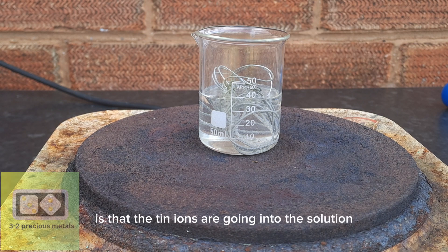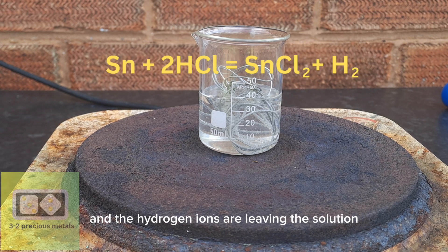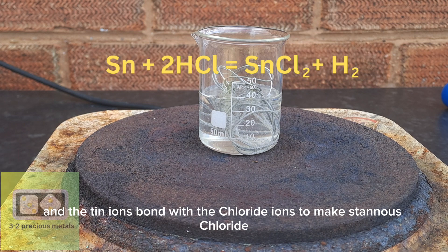What is happening here is that the tin ions are going into the solution, and the hydrogen ions are leaving the solution. The hydrogen leaves as a gas, and the tin ions bond with the chloride ions to make stannous chloride.